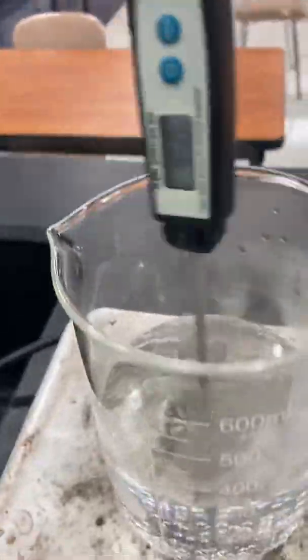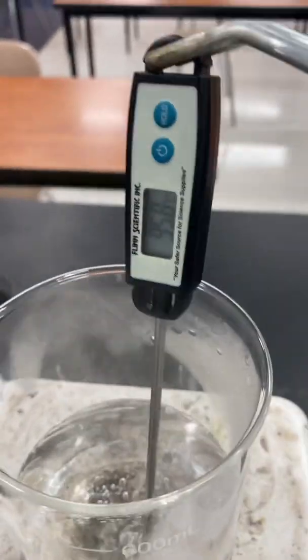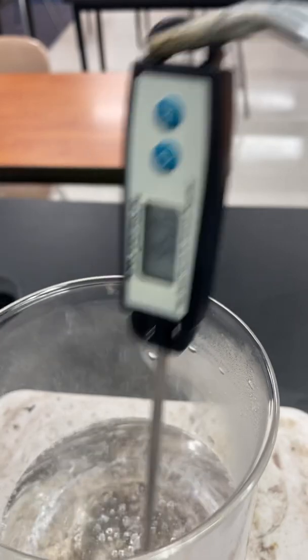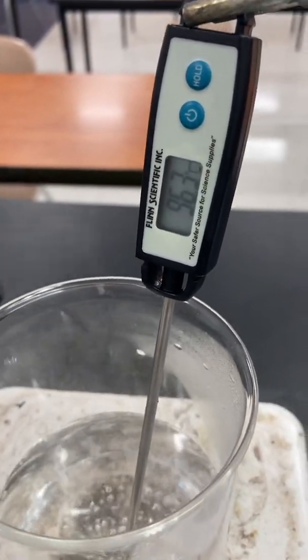Okay, now I would maybe describe this as starting to boil. But until all of that water is bubbling, I really wouldn't consider it boiling yet. Okay, at 11:30, we're at 96.4 degrees Celsius.